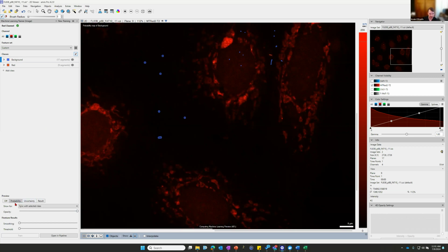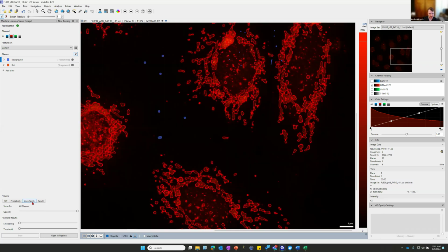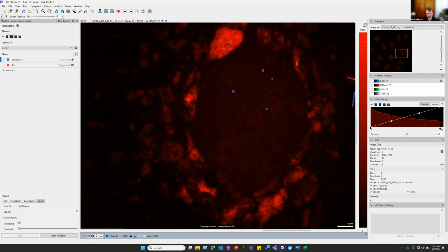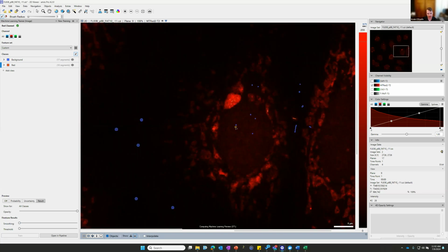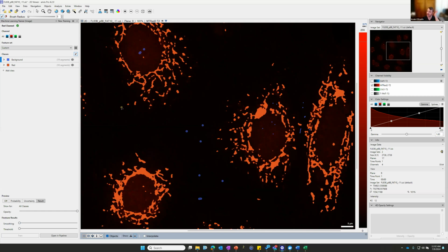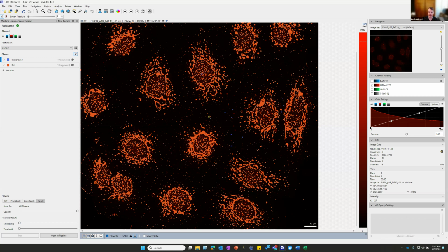You can also do this probability map. You can change the opacity, which I think you just saw me do. And then we can also fine tune these results. So if I want to now really smooth this over, you can see it's kind of grabbing all of this information. Let me just get this. Some more background here. Oh, and one other thing, the previewer on here is just an approximation.